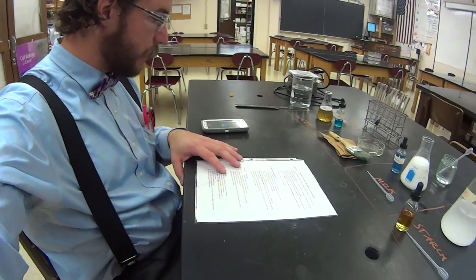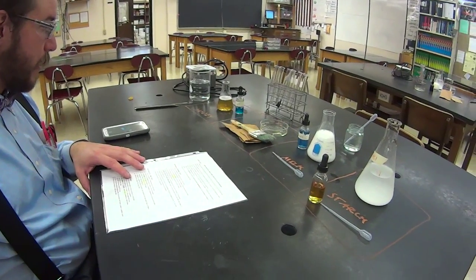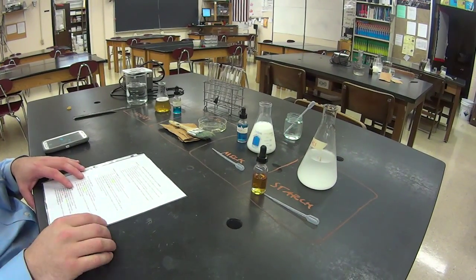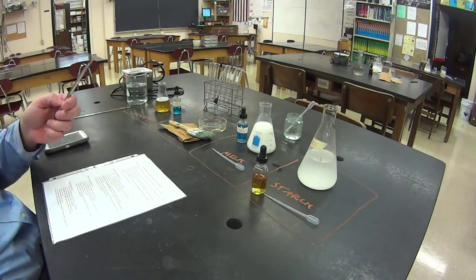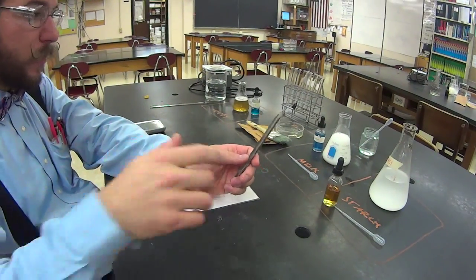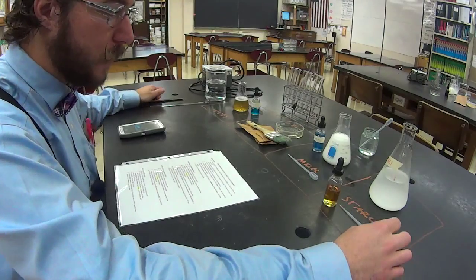So, you have a different unknown food sample and you have different known food samples. You're going to use this scoop right here for the unknown. You're going to use the pipettes for all the knowns.